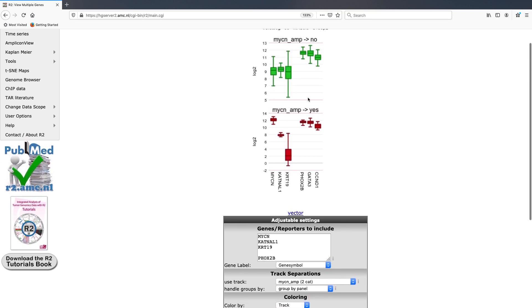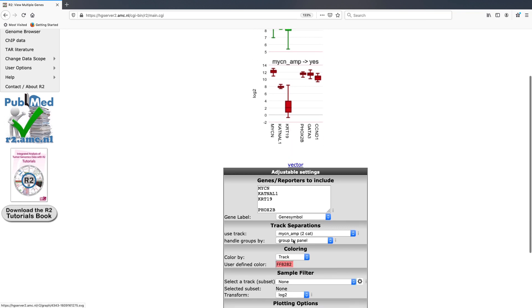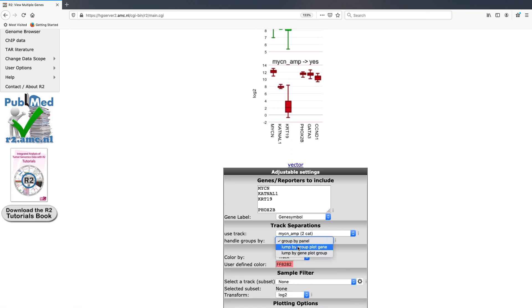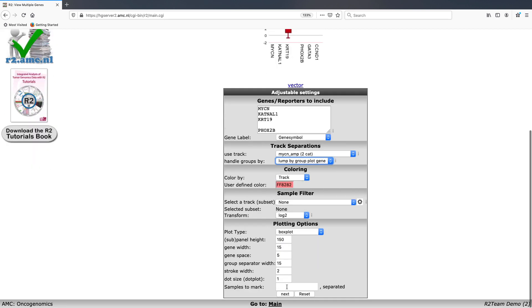For instance, if instead of having it as two separate panels, we'd like to have it all in one, you can then select handle groups by and lump by group and click next.